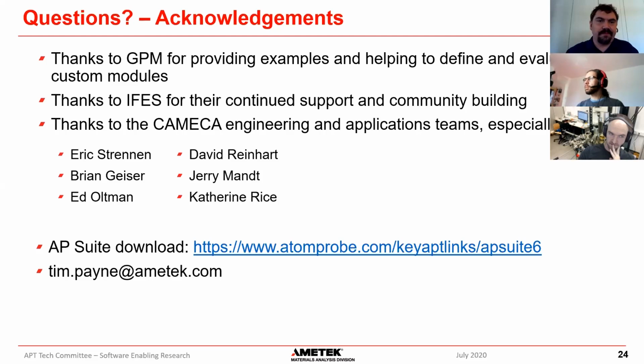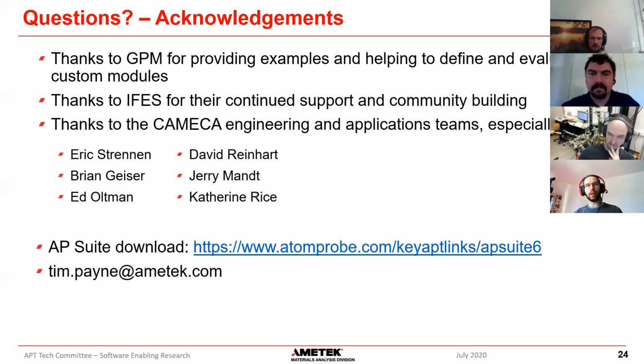All right, any more questions? I had one. I can't use the Q&A function very easily as the host. Can you comment on whether the custom modules run as fast as the built-in modules, or is there some kind of speed penalty because they're custom code? They will run as fast as the built-in modules. Obviously, you would have to do your own multi-threading, for instance, if you wanted to take advantage of a large CPU.